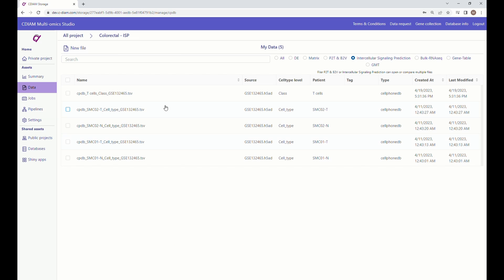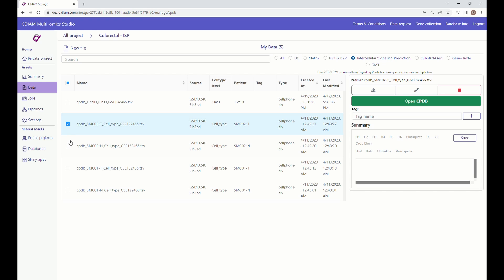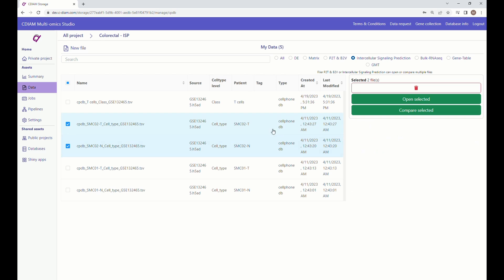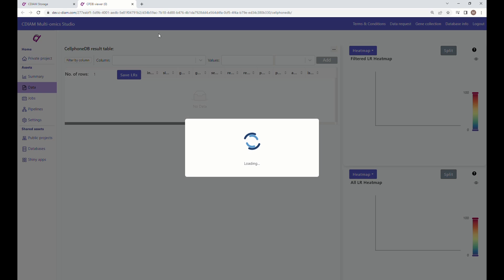To compare two different CPDB datasets, you can go back to data and choose two datasets that you want to compare, and open the selected.